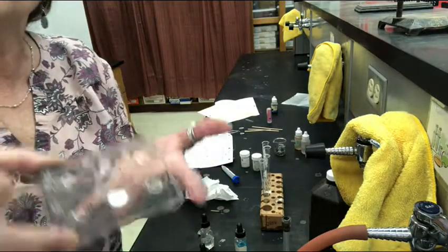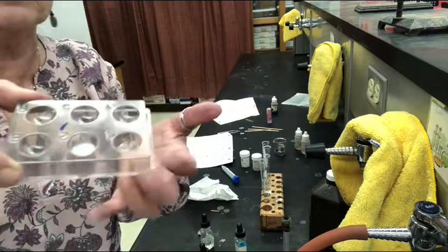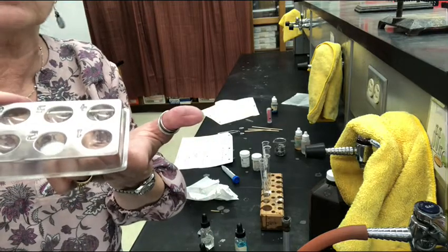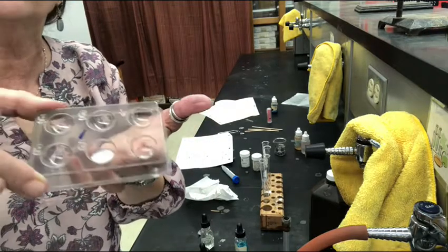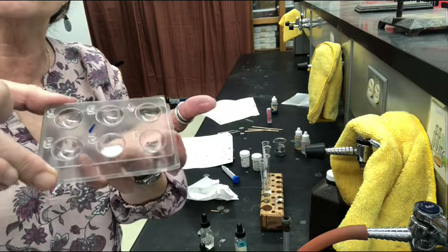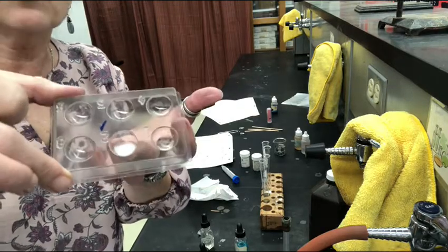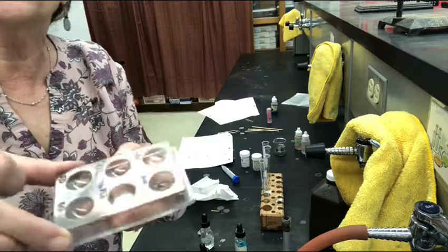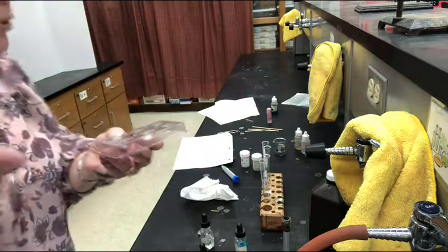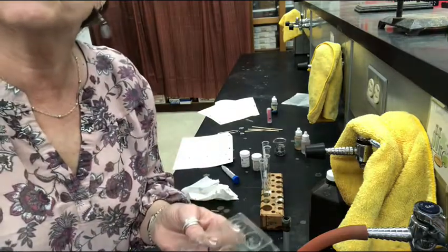No real temperature change but that's a precipitate that's formed. Okay, here's the sodium chloride by itself. This is the silver nitrate that was clear, with salt water in it now it turns into a white cloudy precipitate. That's reaction number five, no temperature change.